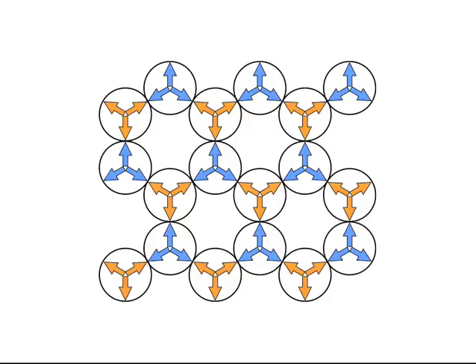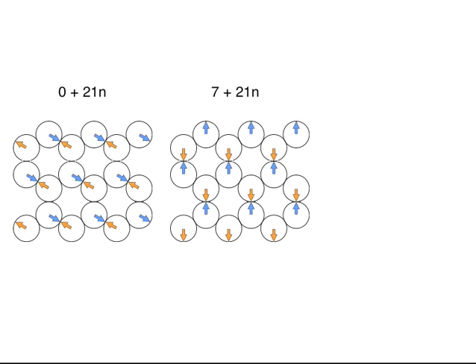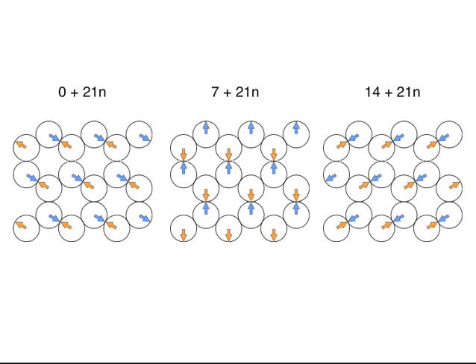Of course, we're not limited to only two helices. We can expand this pattern a bit in the x and y directions. Again, if we look at individual slices that run parallel to the xy plane, we can see where potential staple crossovers can go between neighboring helices. At every slice positioned at zero plus 21 times n bases, we have potential crossovers at this angle shown here. At each slice at seven plus 21 times n bases, we have potential staple crossovers going up and down, and the third set of possible staple crossovers is at 14 plus 21 times n bases.